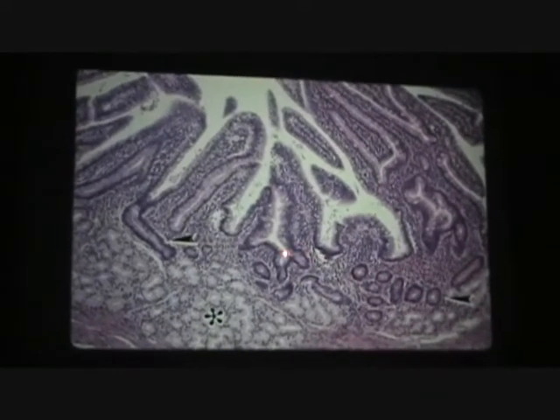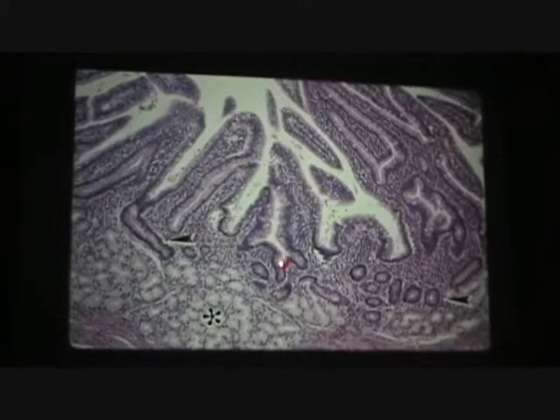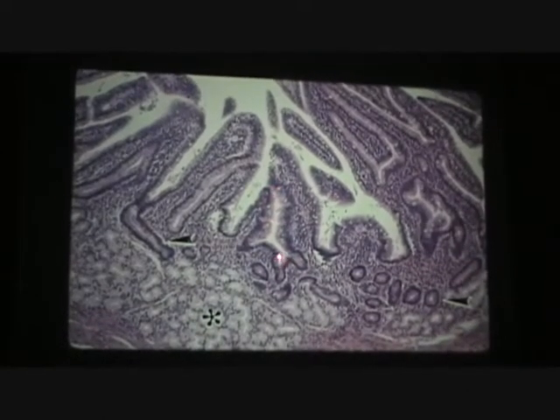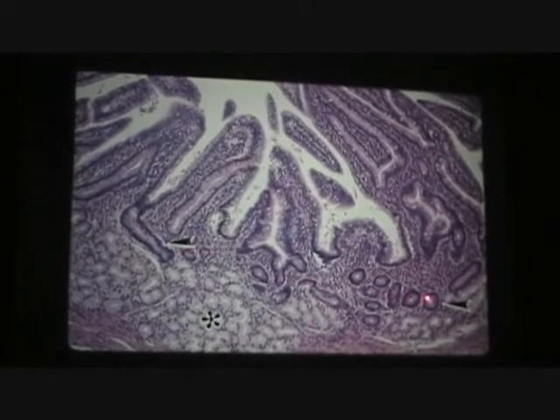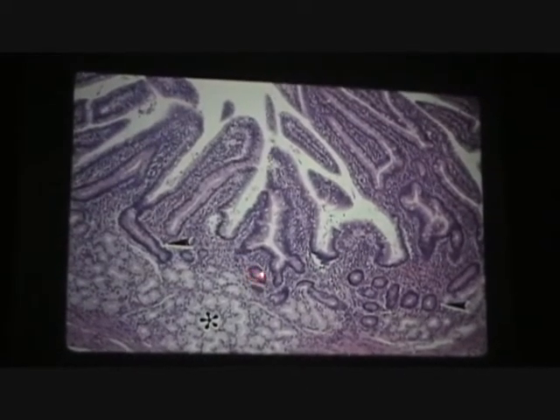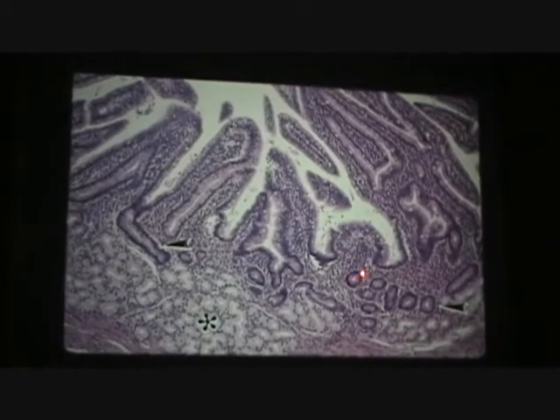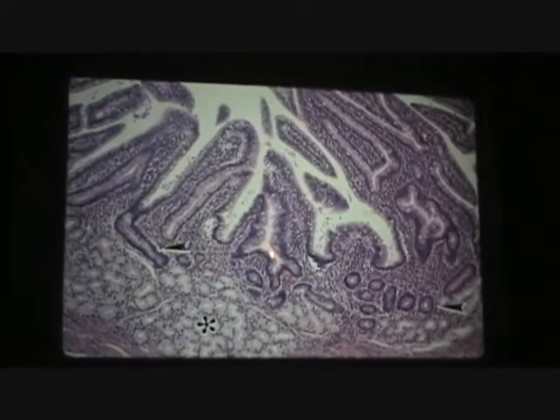They're the same. And that it's a 3D interpretation, knowing it had depth, and that a crypt goes straight down and then it turns 90 degrees once it hits the submucosal interface right there. It's like it can't go into the submucosa, so it's got to pull up and turn. And so now you have this inverted cane, or this L shape. So these are crypts, just like these.